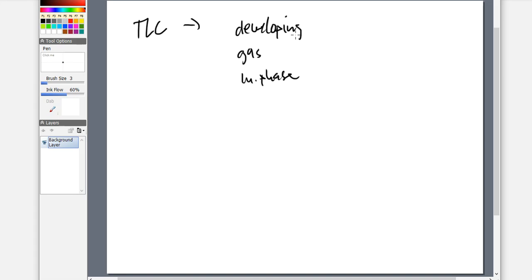So these are three terms that we've talked about. We've already mentioned them, we talked about the differences of them, and we talked about the importance of them. Of course they are. Well, the chambers are meant to allow this process to happen, and also to give me some options about how I want to develop these plates when I do place them inside of the chamber and put the lid back on. But the only way that I get these choices, these different modes of development, is if these tanks are what we call twin trough.